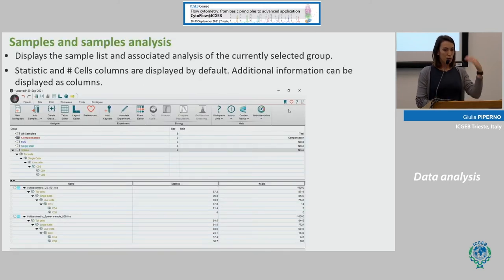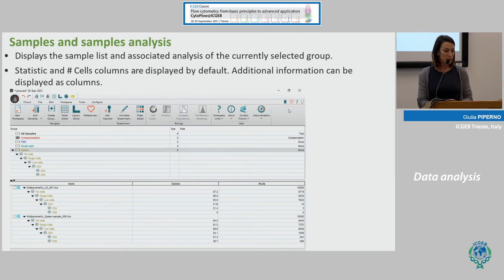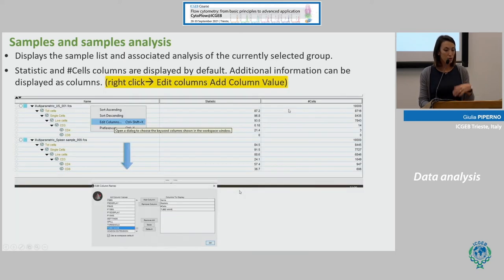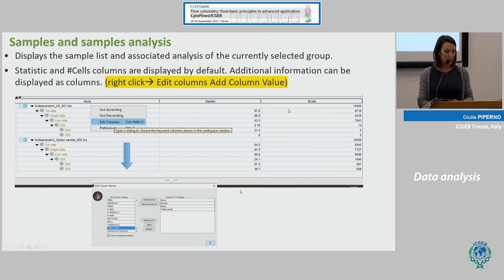Going to the last part of the workspace — the sample and sample analysis section — here you can display the samples you added to your workspace. By default you can see the name, statistics, and number of cells, but you can add columns. To do that, right-click with your mouse, select Edit Columns, and you can add different column values.